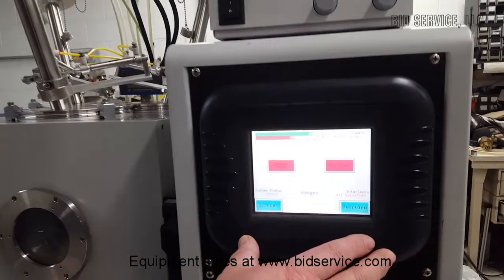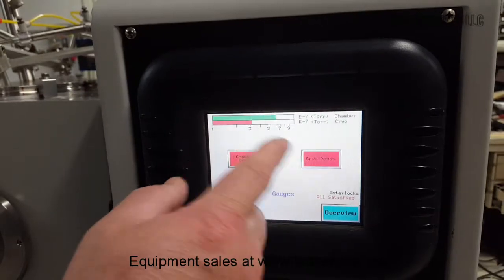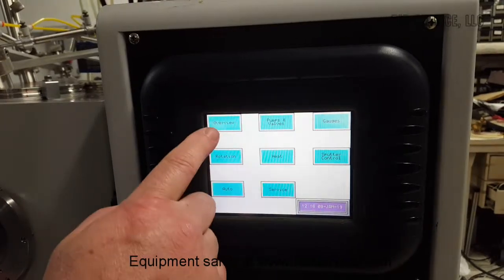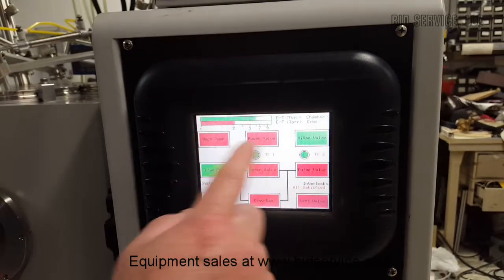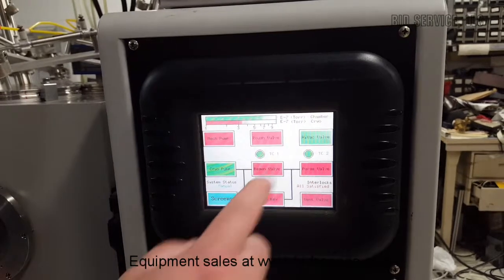Right here is your touchpad controller. As you can see, right now we're bouncing around three to six and into the seven range. There are several screens in here with an overview that shows you everything that's going on with the system. You've got pumps and valves where I can manually change everything — you can see the cryo pumps on and high vac valves open.